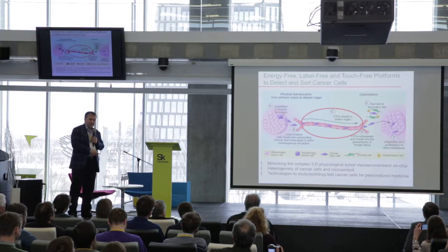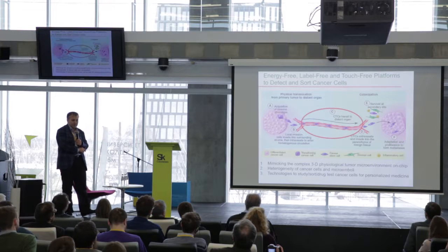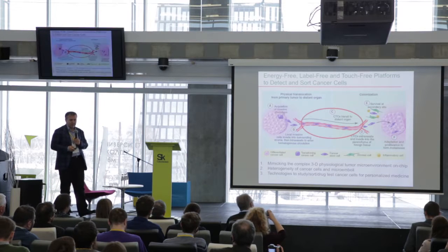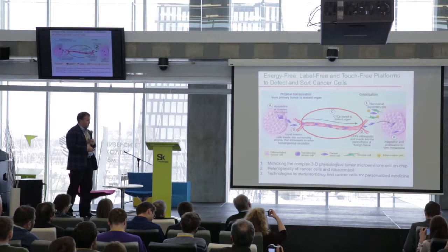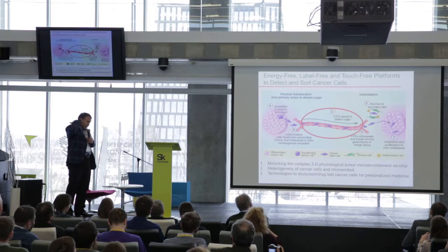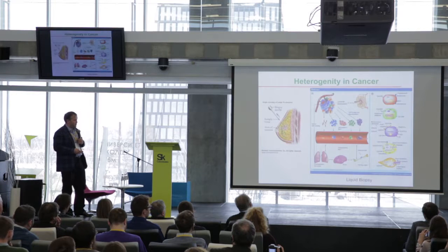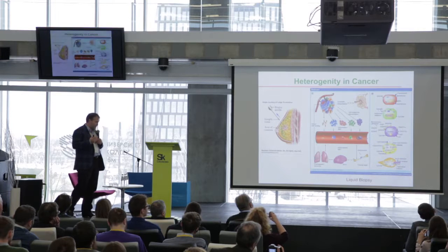It's important to apply this to circulating tumor cells, which people have been capturing with epithelial type, EpCAM-based antibodies. But if you look at kidney cancer, those cancer cells don't have EpCAM. And capturing cells with magnetic beads and antibodies is very costly. That's why you could only process 7 to 10 mLs with the current technologies, and they're not that accurate. So what we are trying to do is pull out these cells by using some fundamental characteristics of cancer cells that are different, mainly density.